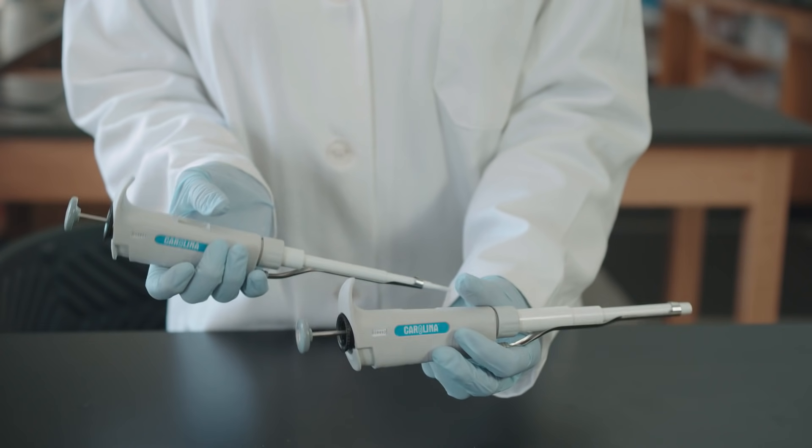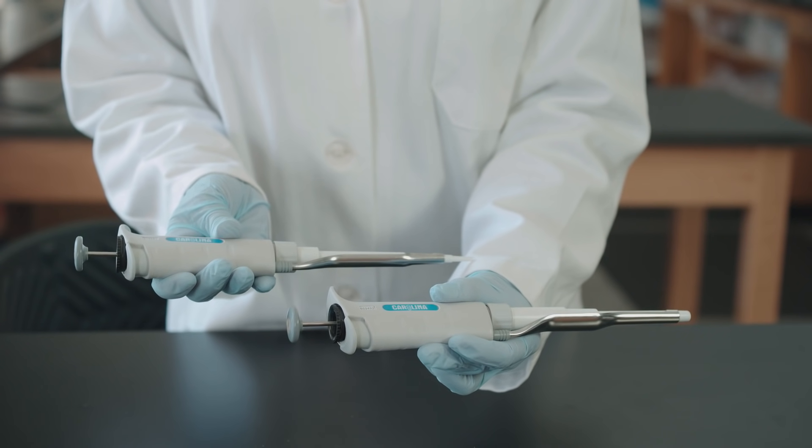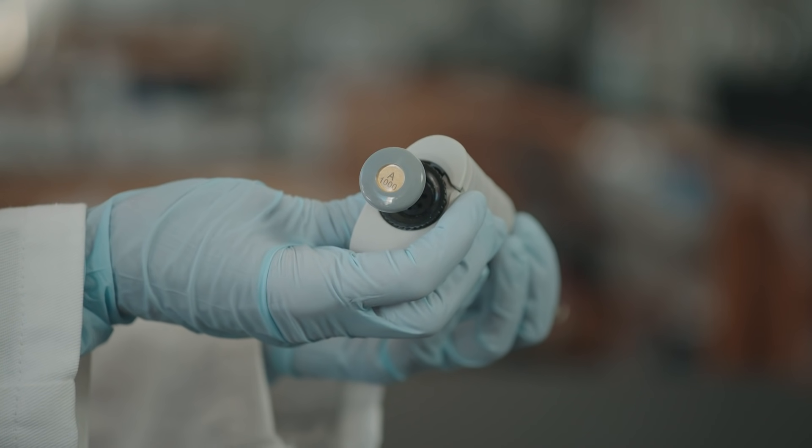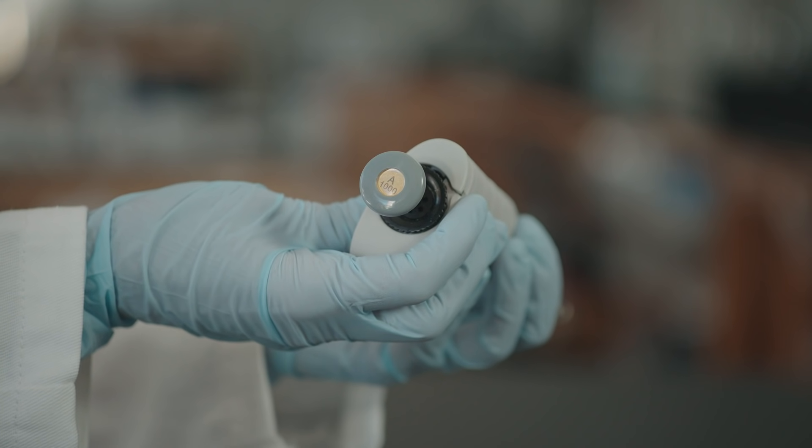Each pipette is marked to indicate what range of volumes the pipette is used to measure. This is a P1000. It is used to measure volumes from 100 microliters to 1000 microliters.